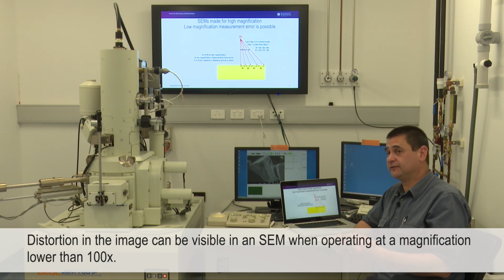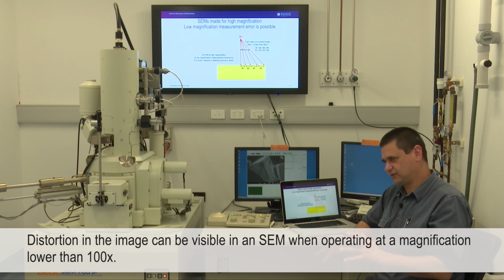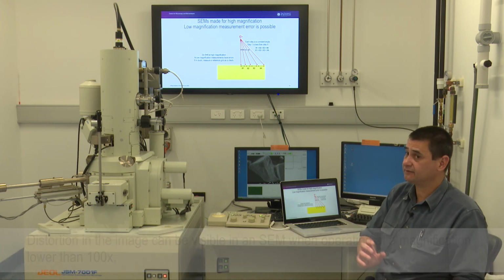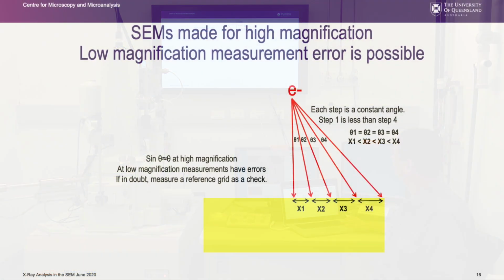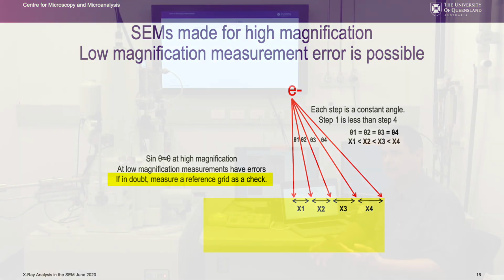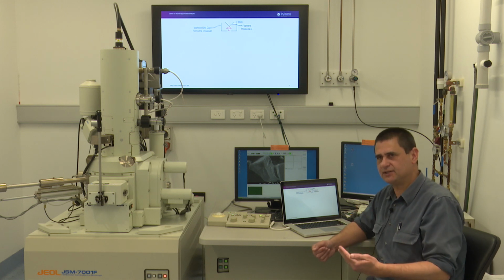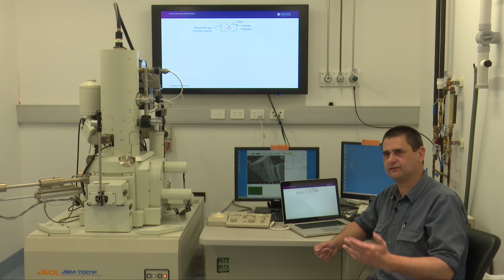So the electron microscope is a powerful magnification tool, but it has a distortion at lower magnifications, in which case light is a better tool to use. If you're not too sure, I always recommend you put a reference material in there, a reference grid where you know its exact spacing, and just image it the way you would image your normal specimen and check whether you've got any distortions.